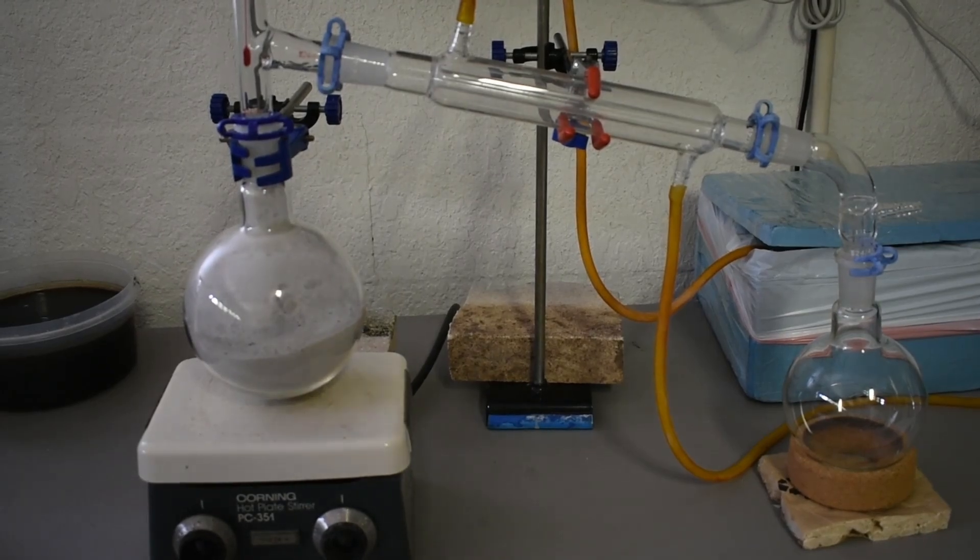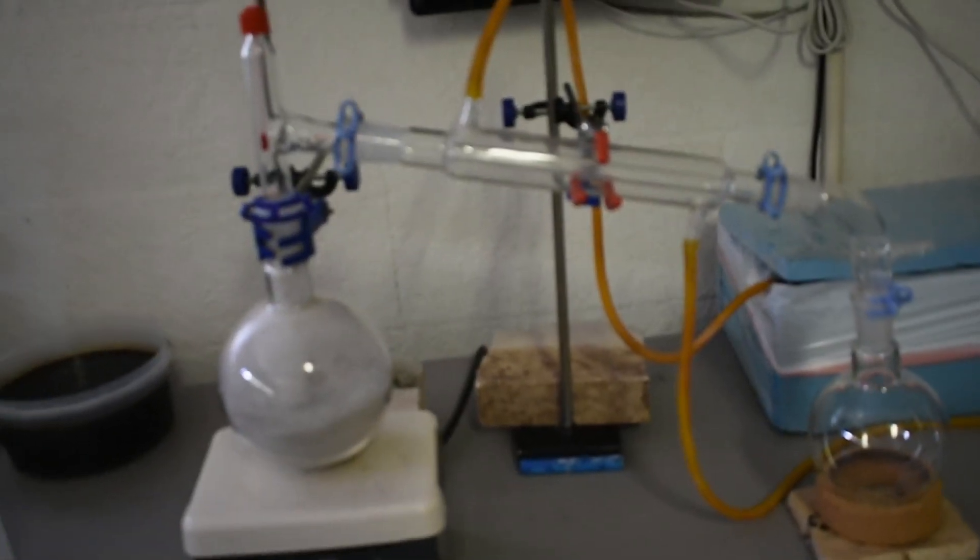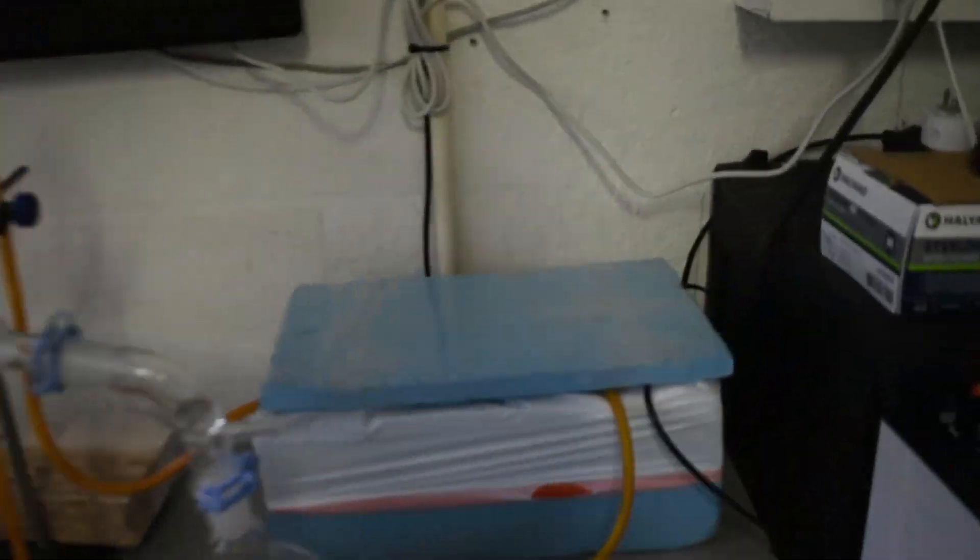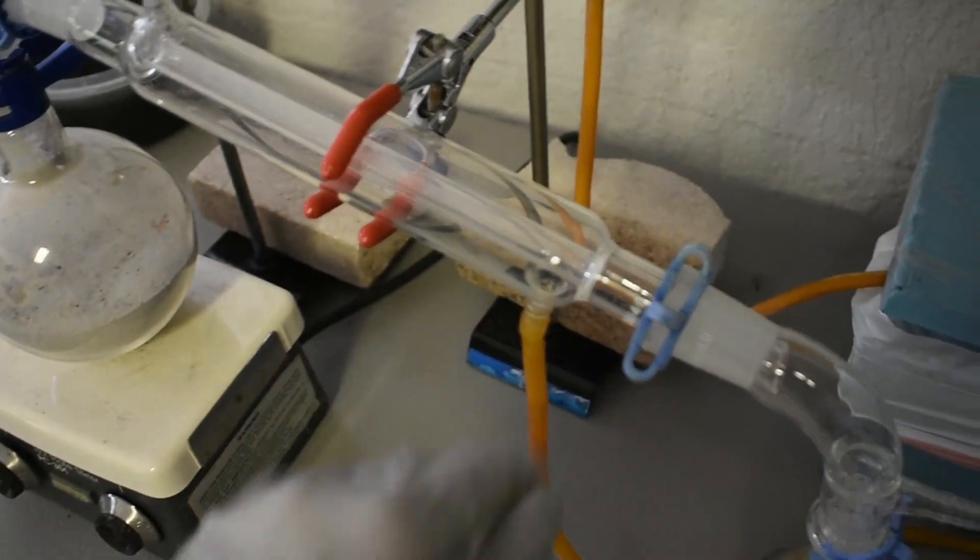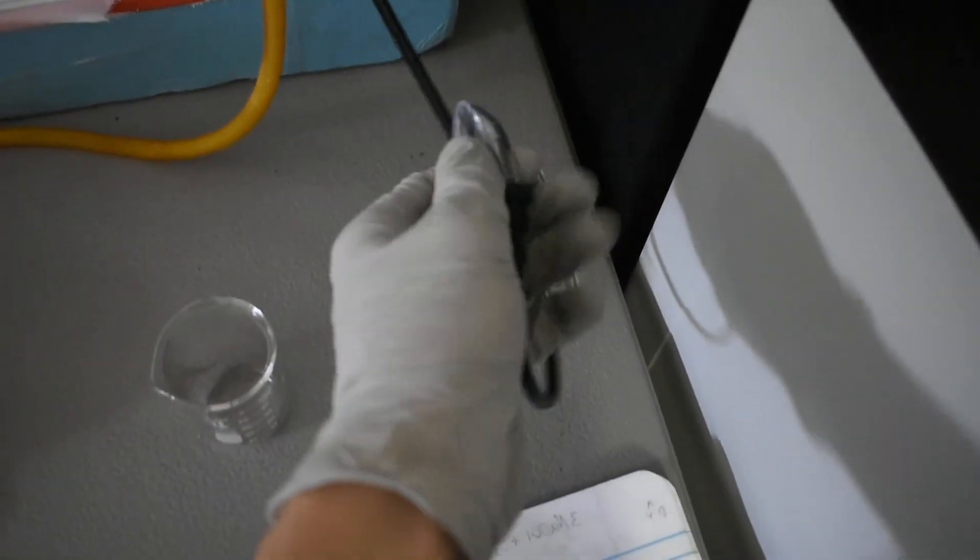And in case you're wondering, this is how I circulate the water. This is an old Deschem box, and I just put some ice packs in there and a little aquarium pump you can get off eBay. Then I put the lid on for insulation, and the tubing goes to the condenser. We can actually plug that in right now.